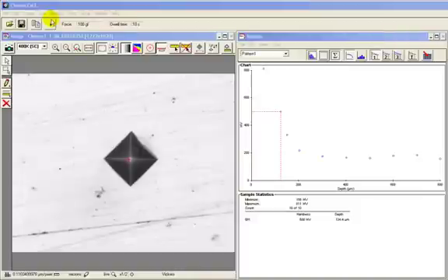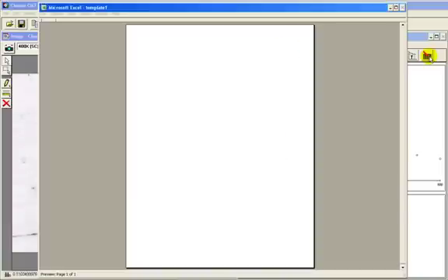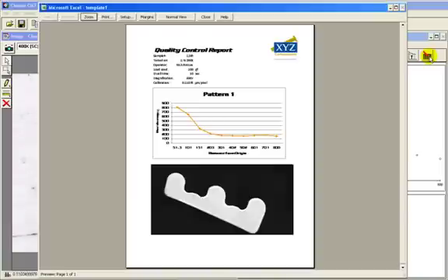Once the run is completed, the software can generate a report on the left. The test pattern will report automatically based on a custom, user-created template.